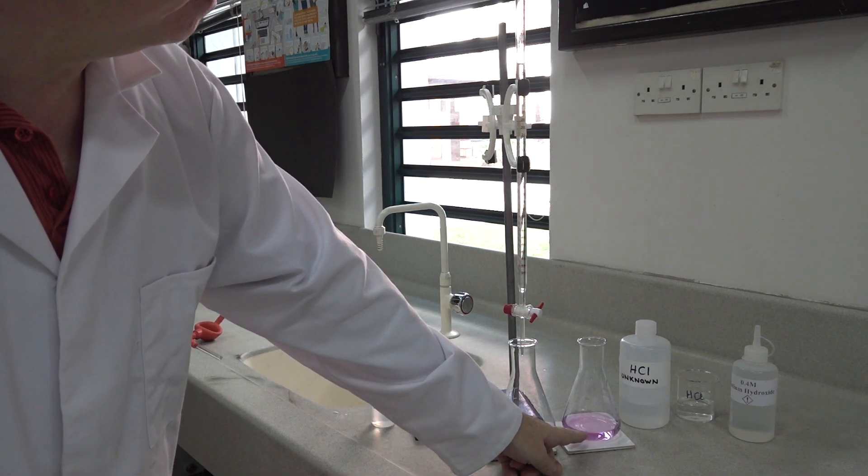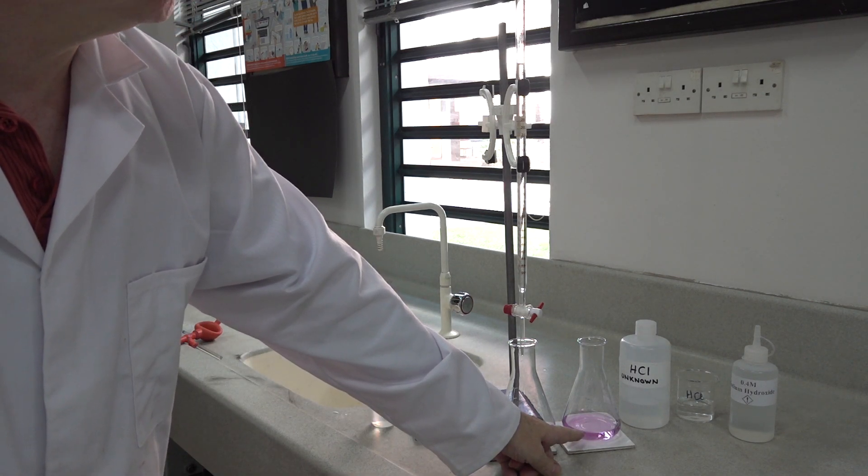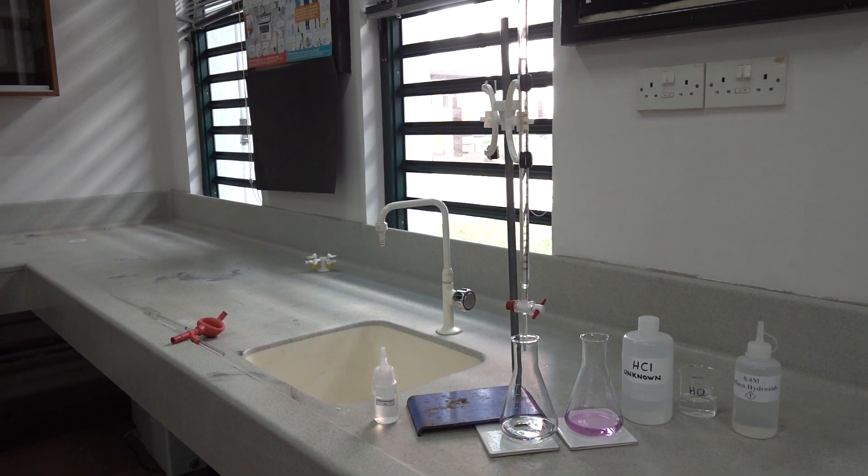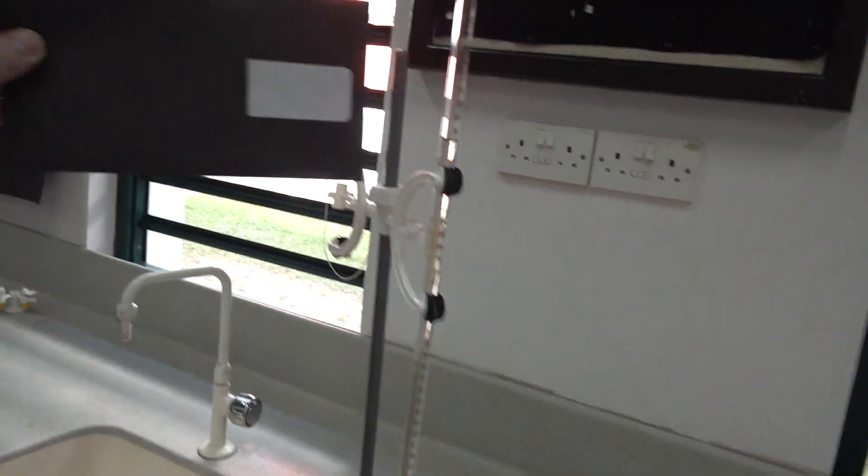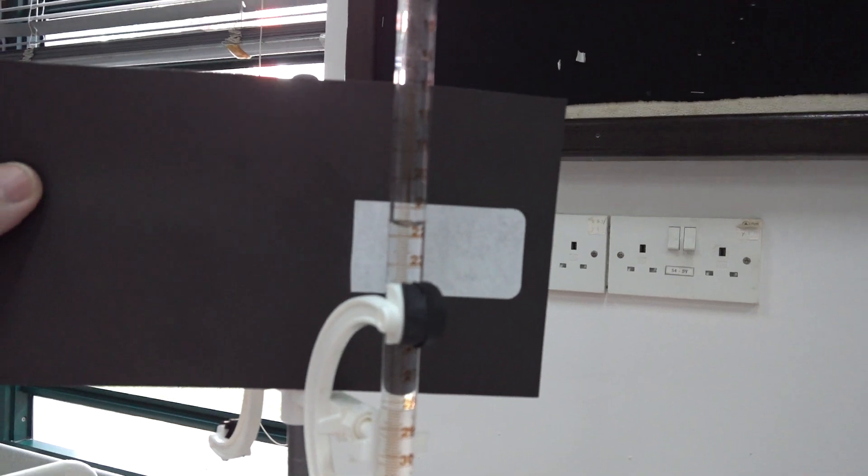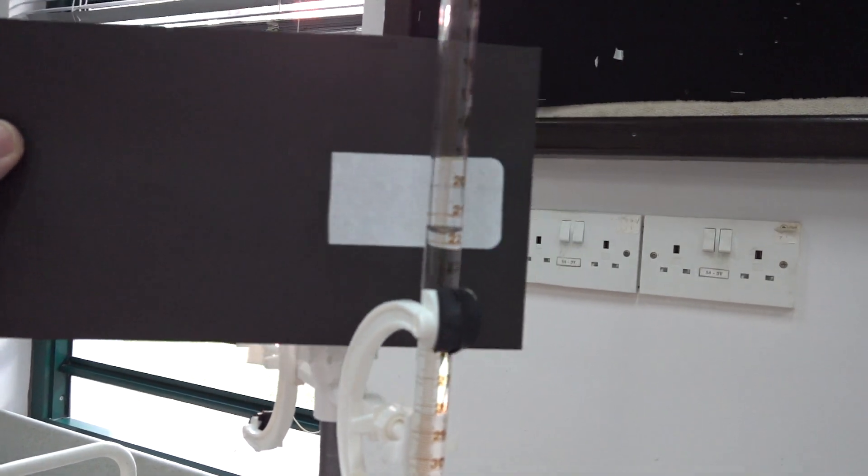We've already done a rangefinder, our first titration, which gave us a result of 21.7. We need to take a starting reading on the burette here. You should be able to see that is indeed where we finished off last time: 21.7 centimeters cubed.